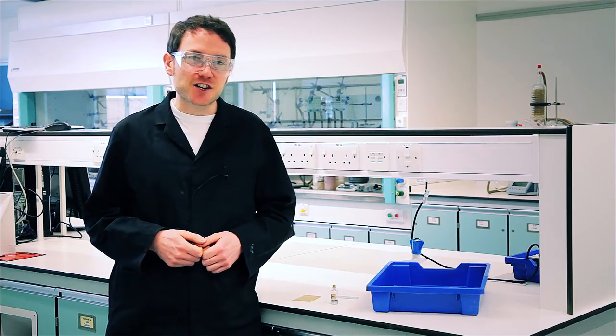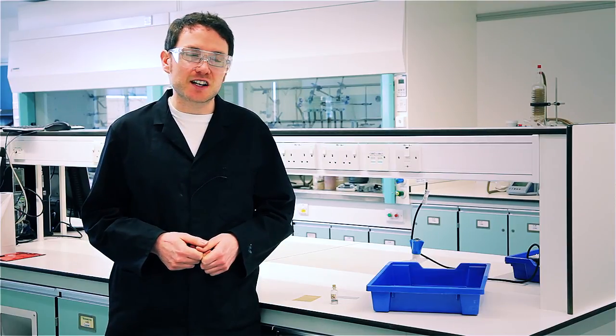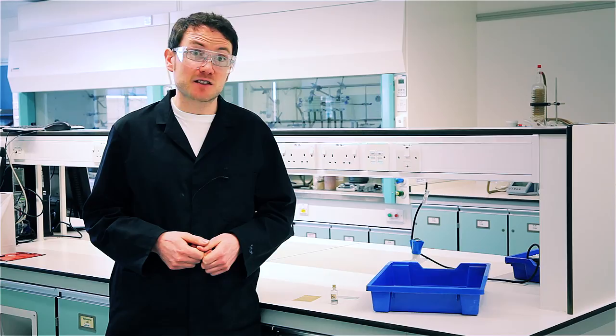So when would you be likely to show this? I'd normally bring this out when teaching about structure and bonding — it's a great way to show that like dissolves like.